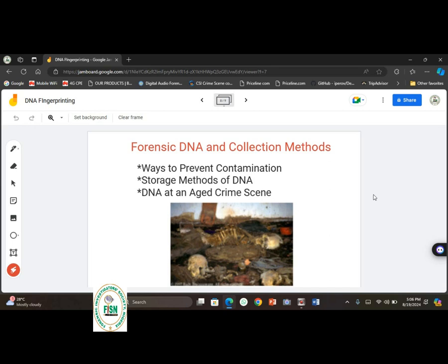As we said in the other class, one of the potent methods of decontamination is to use jik, that is bleach. So wash those things in bleach, or just immerse them in bleach. The contaminant will go.